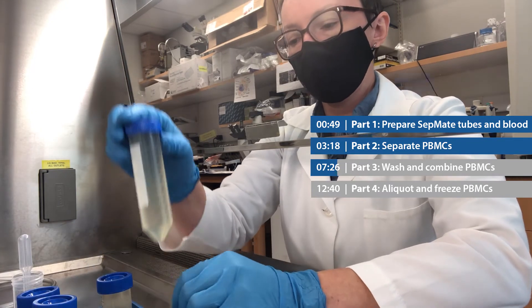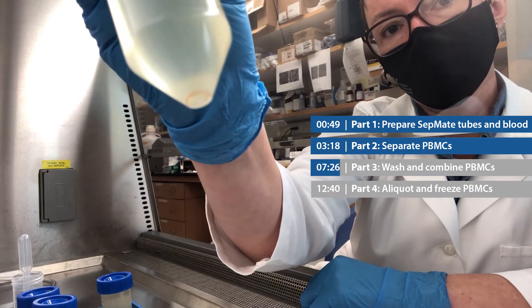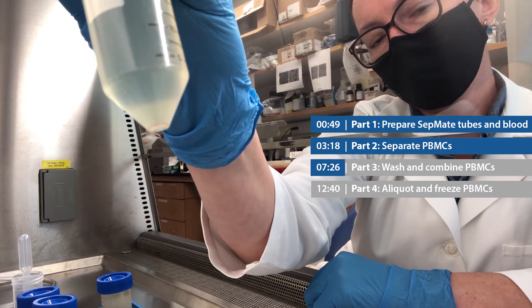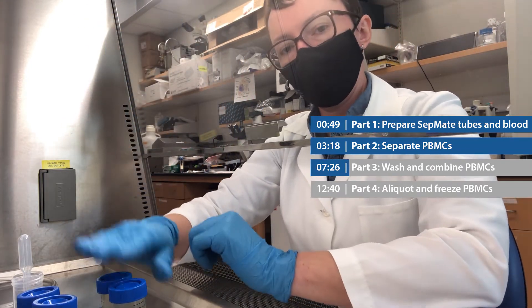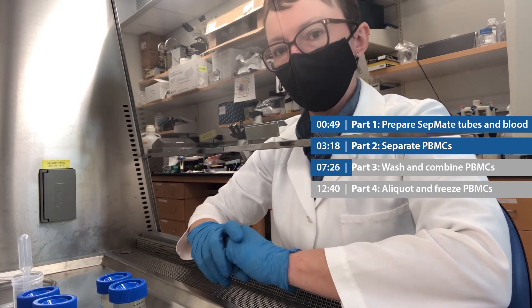I just spun my cells — let's look at the cell pellet. Hopefully you can see there's a little pellet. It's a little bit pink because there are a few red blood cells, but that's all right. Now I'm going to very carefully remove the supernatant from all four of my tubes, being careful not to disturb the cell pellet at the bottom.